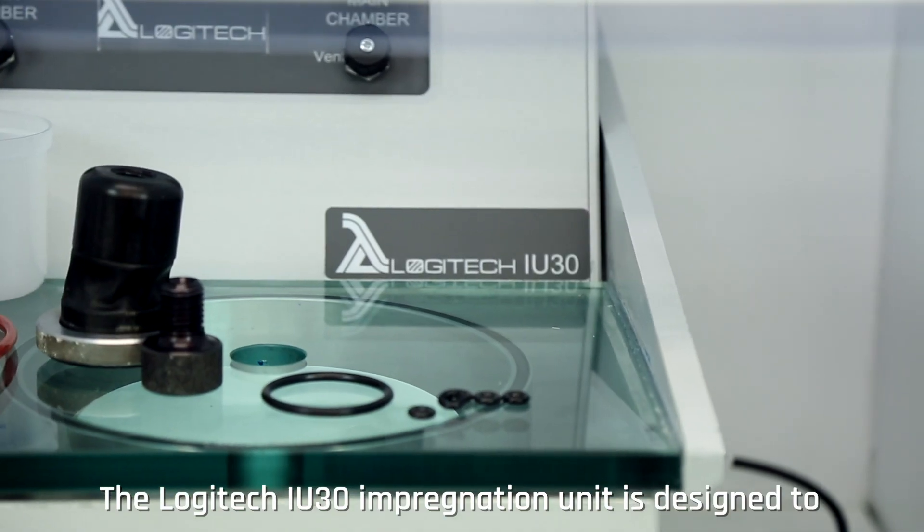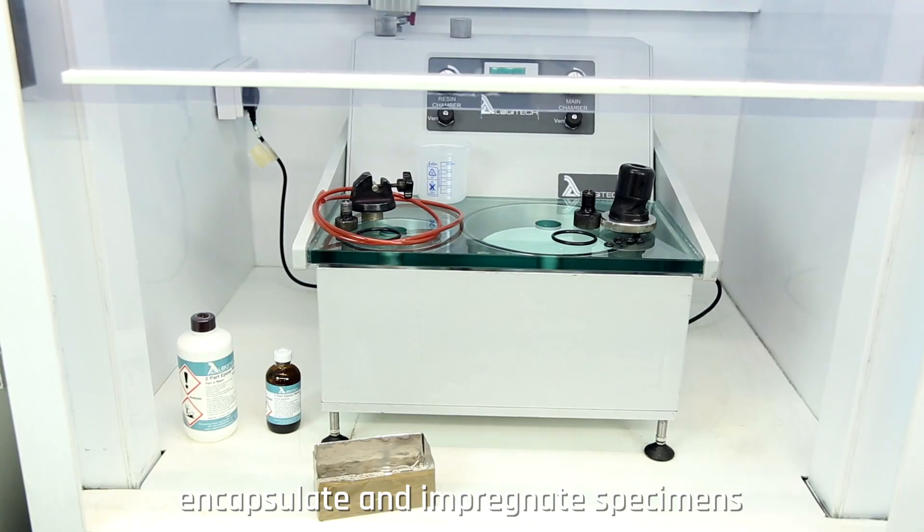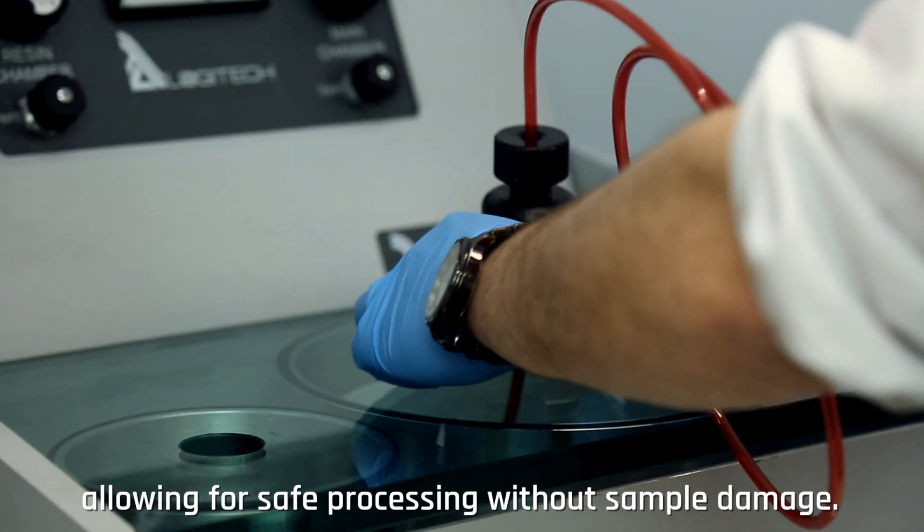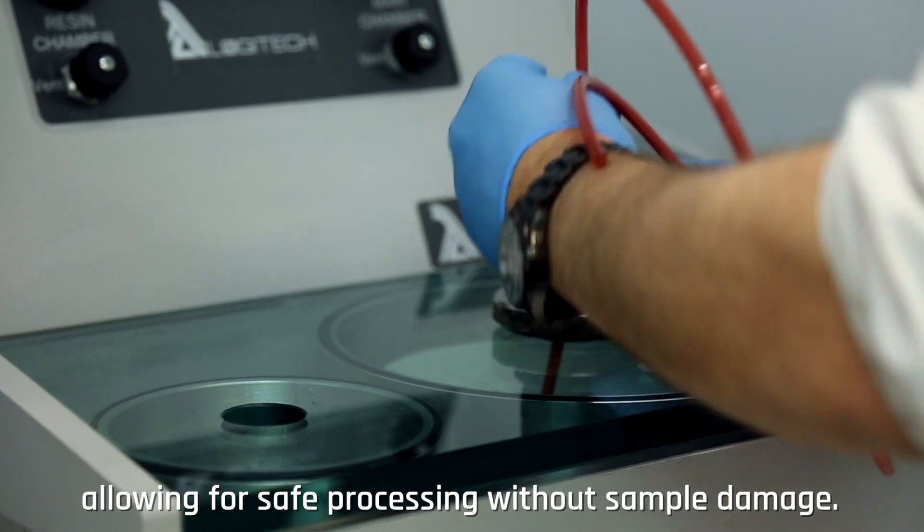The Logitech IU-30 impregnation unit is designed to encapsulate and impregnate specimens with synthetic Logitech resins, allowing for safe processing without sample damage.